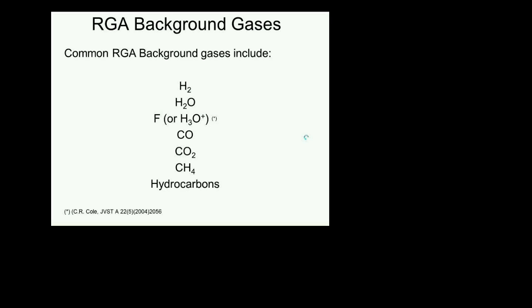You will also see that some of the vendors, when they clean the stainless steel and do the degreasing process, use perfluorinated compounds as well, and then the product will come to you with a 19 peak to start with. And of course, the 19 peak gets worse. The outgassing of fluorine gets worse when you turn the filament on.